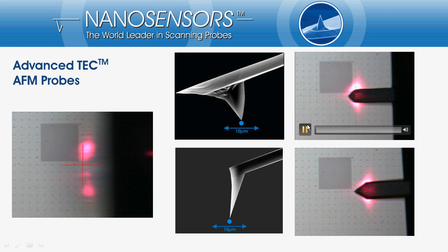We start scanning now with a standard AFM tip. We are able to see in the video that our point of interest, its position indicated by the red colored cross, is hidden by the cantilever.